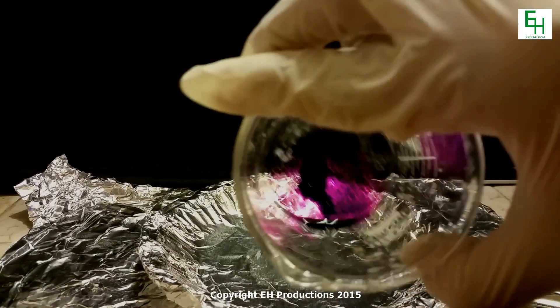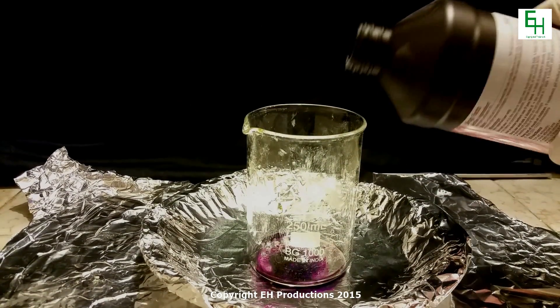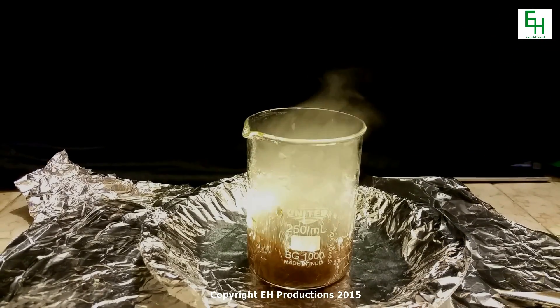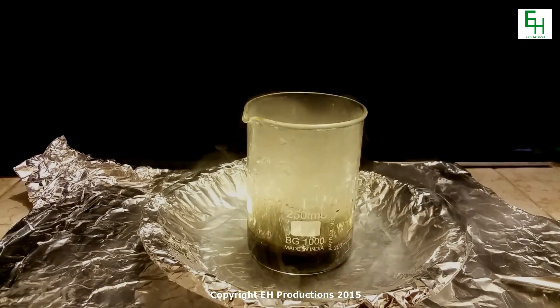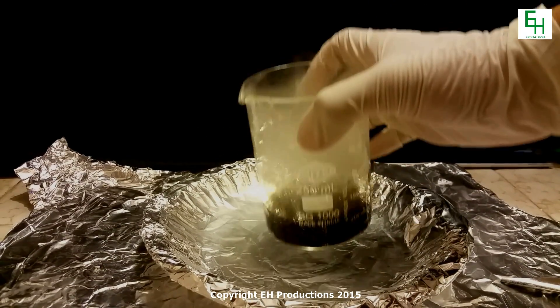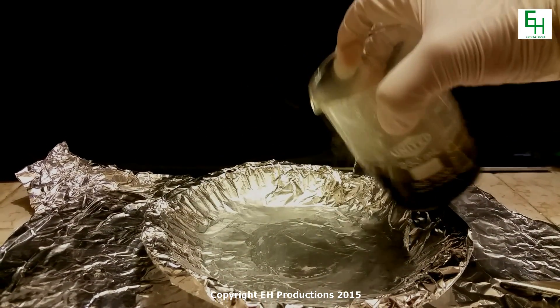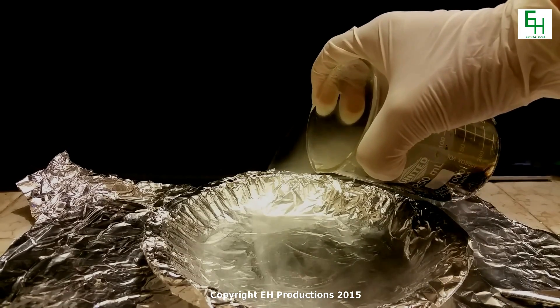So it's a nice dark solution. Now I'm going to add some hydrogen peroxide to that. It makes a very vigorous reaction. It reminds me of dry ice and water. You can see steam coming out.